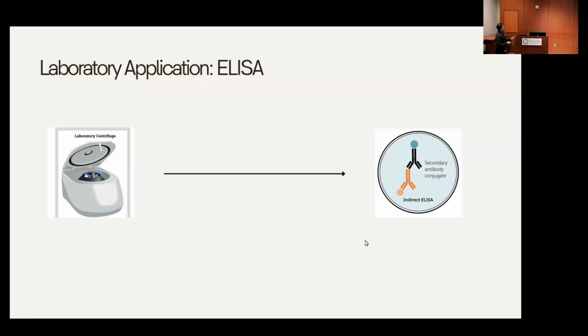And at this stage, if there was no true allergic reaction, then we would only expect to see only the orange dot. There would not be any orange antibody, and there would not be that black enzyme-linked antibody either, because we haven't introduced it. But if it was a true reaction, we would see both orange pieces, the antigen and the antibody.